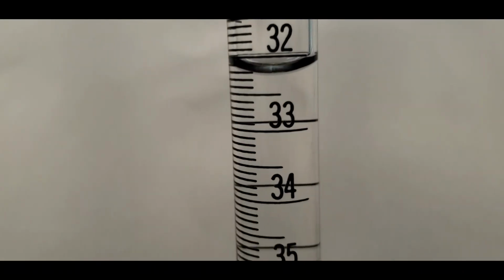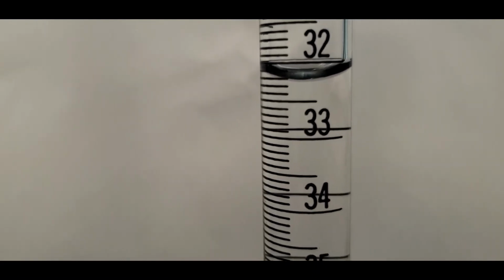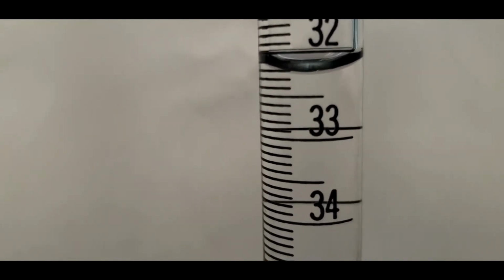All right, here's the volume that was added. And I'm thinking it's past 32, it's past 32.2. And I would say that it's a little bit lower than the 32.2 mark, so I would estimate it at 32.21. That will be the volume for run 1, and then I'll just show you the volumes for the next 2 runs that I did rather than show those 2 titrations.